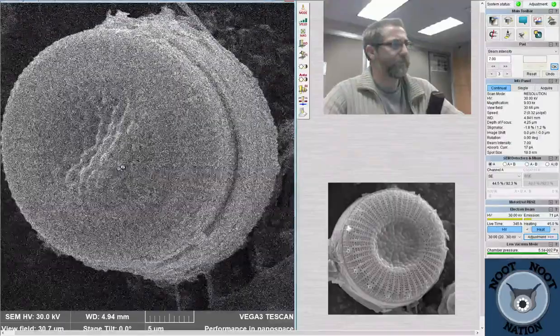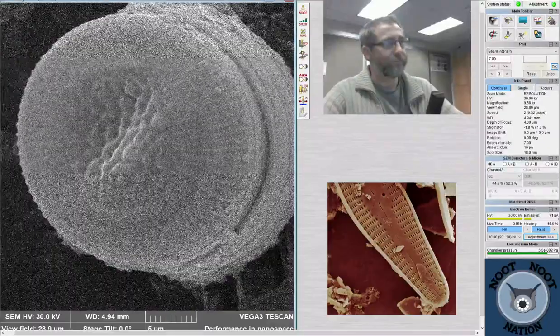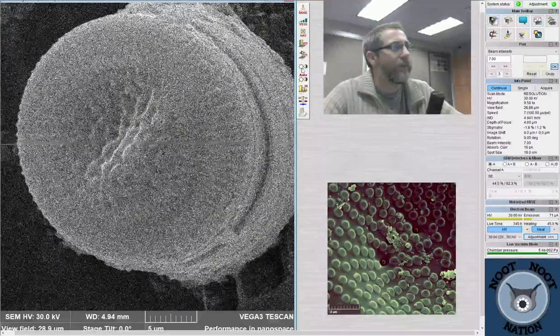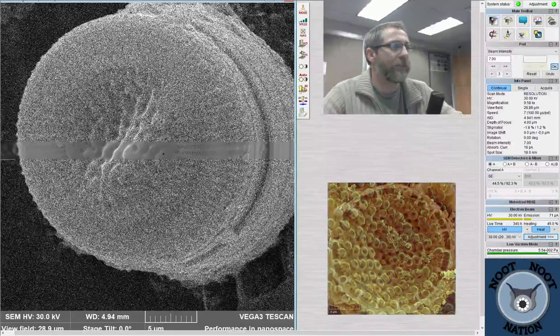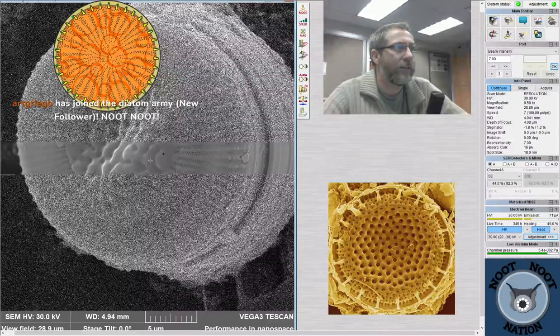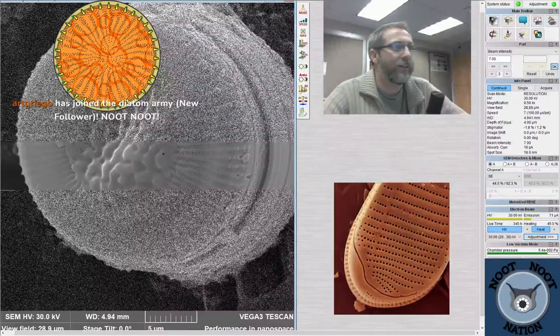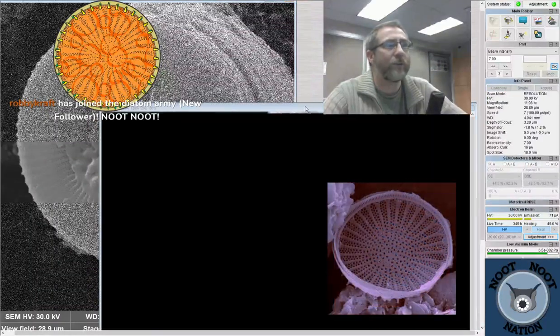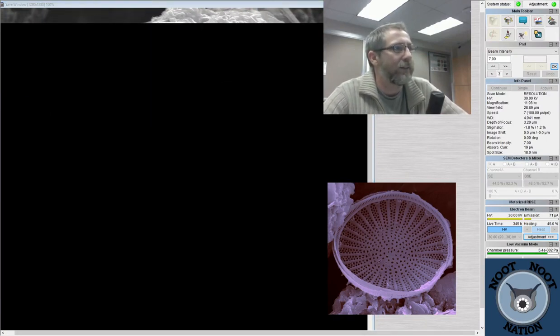The species that we're looking at has, if I can get it centered, a transverse undulation. So it looks like somebody pinched the surface of it, kind of. And that's common in Cyclotella. And also, if we looked closely at these, we'd see that they have their rimoportula somewhere out here on the outside edge of the valve, if it's truly a Cyclotella. Okay. Hey, I can pop back over here and see what's going on.